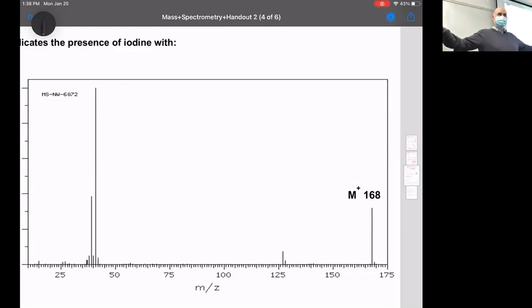In other words, it's not that big of a deal to have a big atom with a +1 or a -1. They're more stable with those charges. So an F+ is really unstable. A Cl+ is really unstable. A Br+ is pretty unstable. An I+ is actually pretty much fine. So when we fragment a molecule that has iodine, breaking off an I+ is something that will regularly happen.